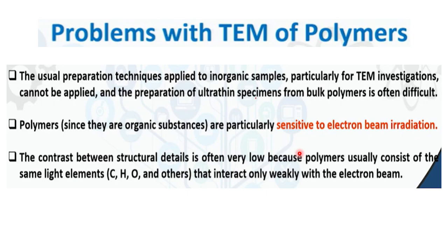See, actually, why should we go for TEM? First of all, we just want to know the size or shape of your molecules. Now, if somebody is working on small molecule synthesis, the TEM data is not that important for his or her research. It may not be. I'm not saying that it must not be important, but it depends on the research field.